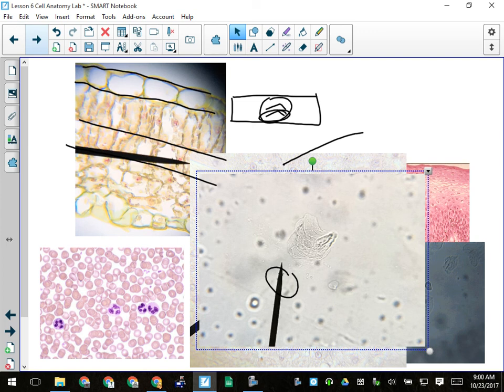Everybody follow that idea, that procedure? Okay, so find an individual cell and be surprised. Once you get the contrast right, you can see quite a few structures within your own cell, even without it being stained. Questions on what we're doing there? Try and get into fairly small groups if you can, like three or less, so that everyone gets a chance to use the microscopes.